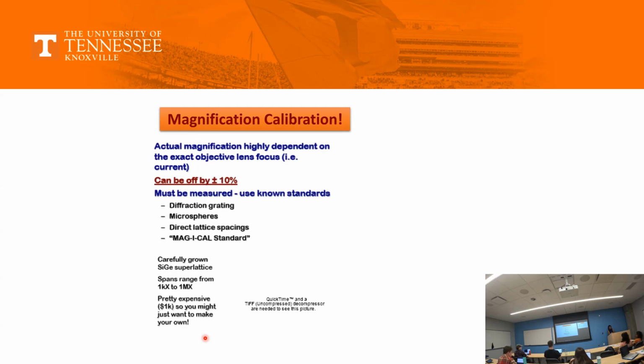There you would do that. Here, if you go to Gerd, he would say, no, this is already calibrated, just press this button, or call the previous setting of the calibration. So this depends on the microscope. We're also getting a new microscope here in GIAM now.